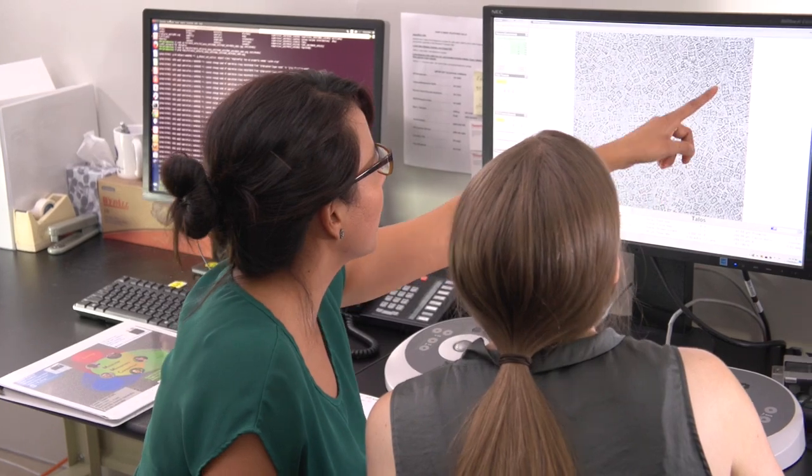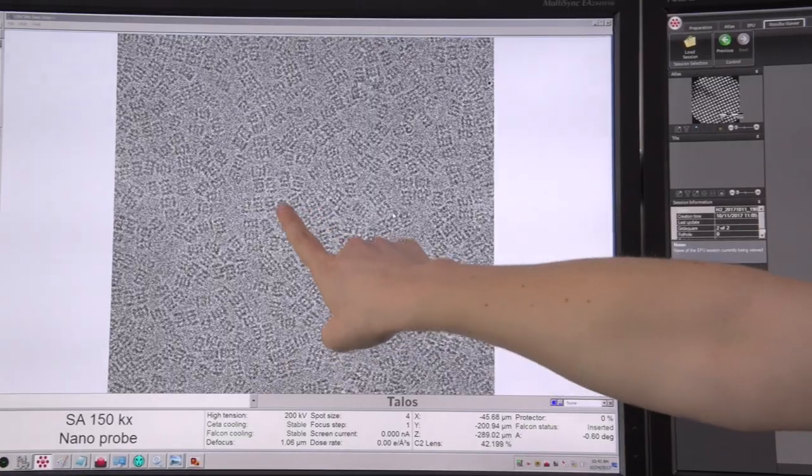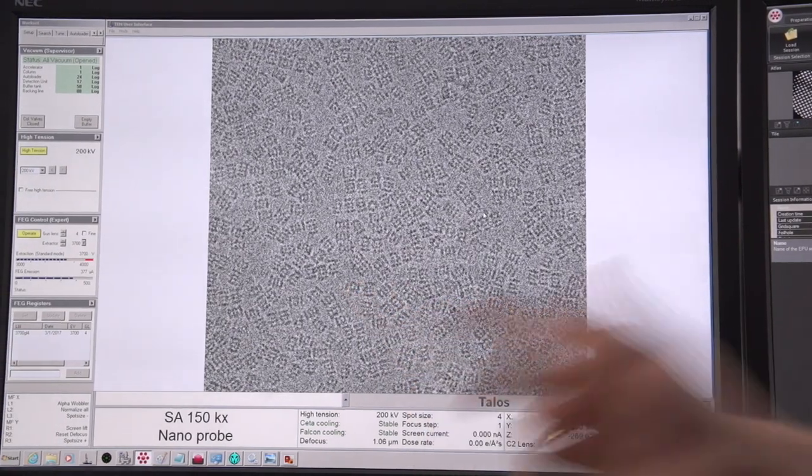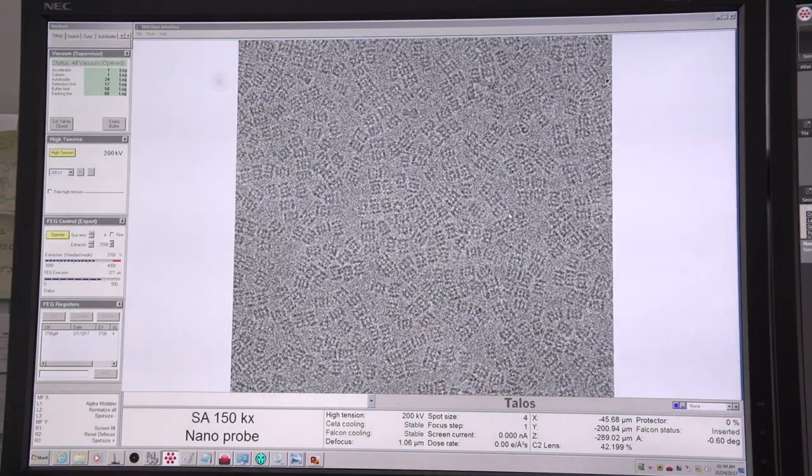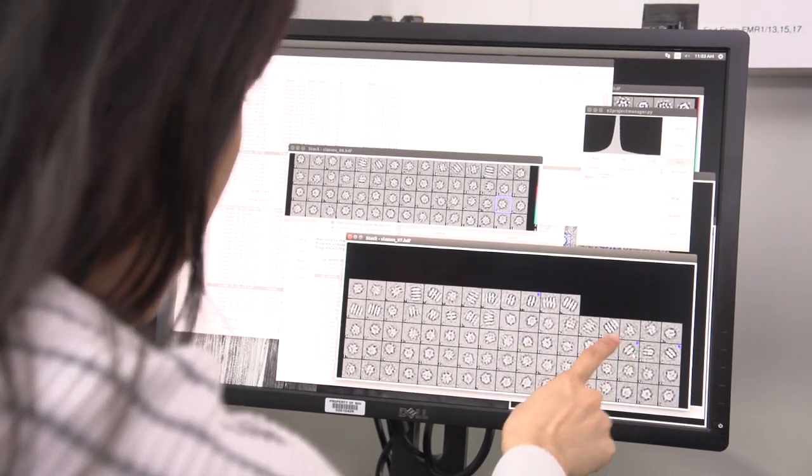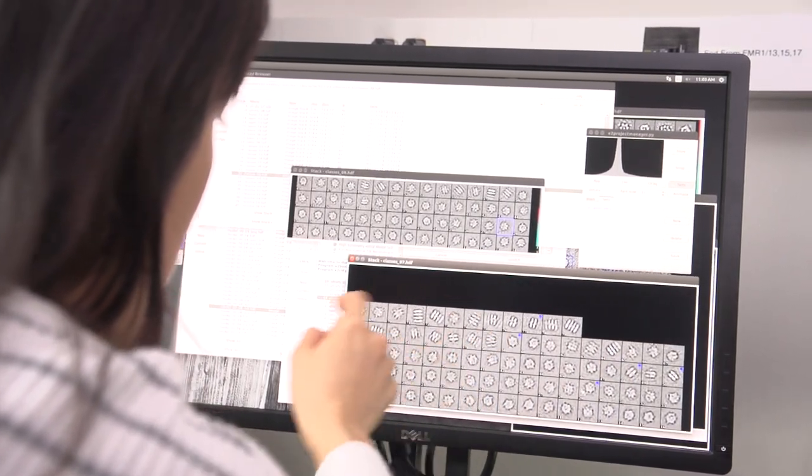This technology allows structural biologists to study large protein complexes. For example, we can visualize proteins at the surface of viruses like HIV or protein switches involved in sensation. This information can be used to design better vaccines and painkillers.